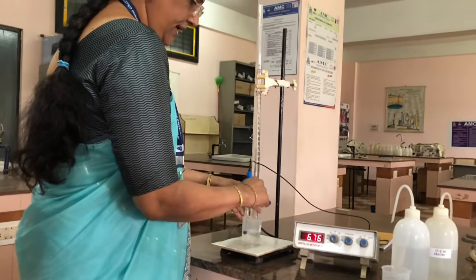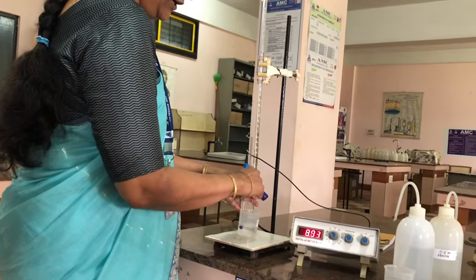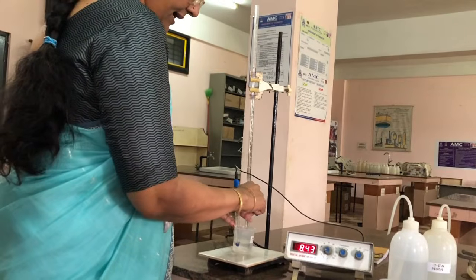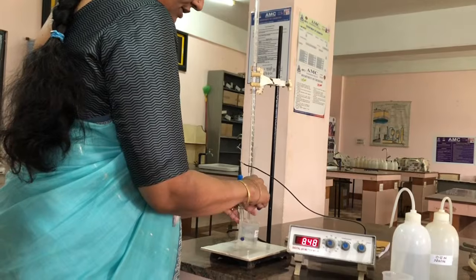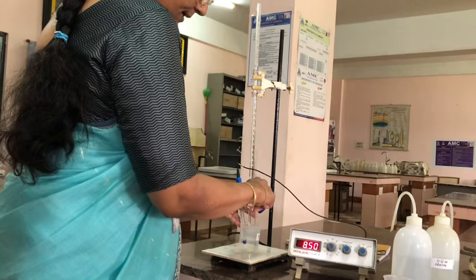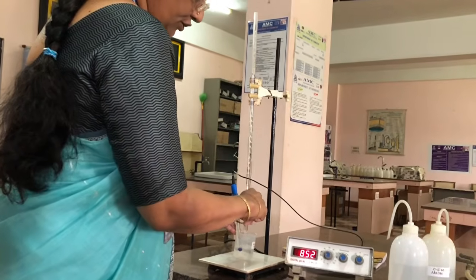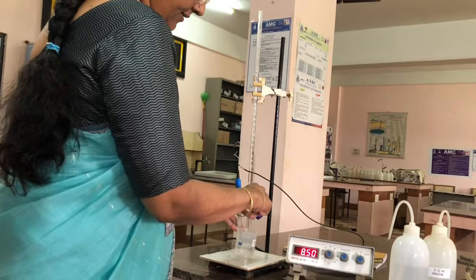See now the pH of the solution is increasing suddenly from 6 to 7 to 8 to 9. That means all the H plus ions are completely neutralized by the sodium hydroxide. It is an indication that the reaction is completed. There are no more H plus ions in the solution. All H plus ions are neutralized. See, suddenly the pH of the solution is increased from 6 to 8.5.